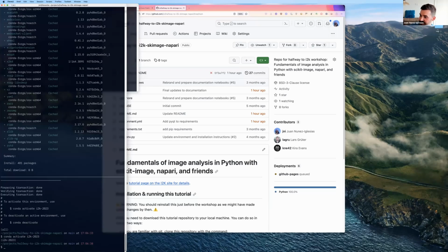So, if you haven't, feel free to follow along, and hopefully it will sell you on Python being quite a powerful framework to do your work. Once you've activated the environment, you can run Jupyter Notebook with this command in the same folder as your downloaded project.